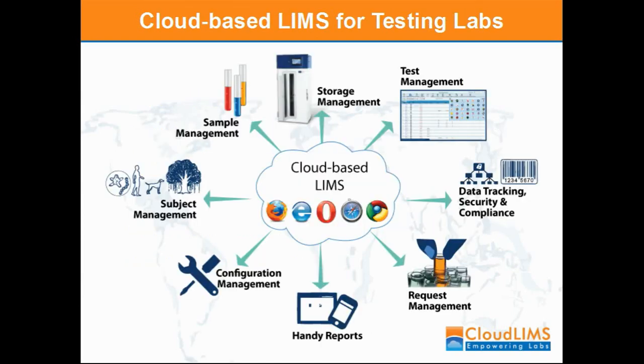Testing labs are under constant pressure to reduce cost, enhance efficiency, and constantly improve the quality of results. These labs need to effectively manage the entire life cycle of each test sample, which includes sample accessioning, recording tests performed on the samples, managing experimental data and test results, besides permanent disposal of samples if required.